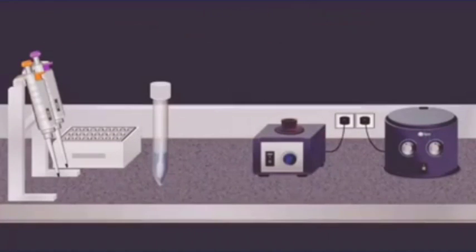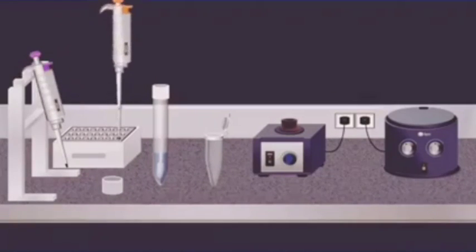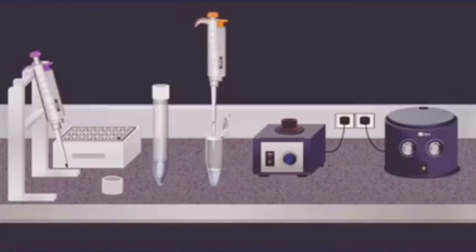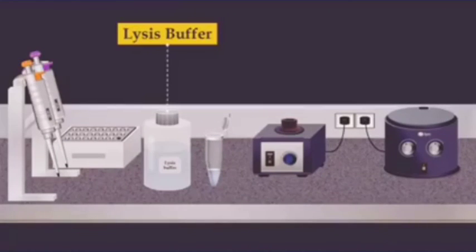To perform this method, basically viral RNA should be extracted. Several RNA purification kits are available for convenient, fast and effective isolation. To extract the viral RNA by using a commercial kit, the sample is first added into a microcentrifuge tube. Then it is mixed with a Lysis Buffer.